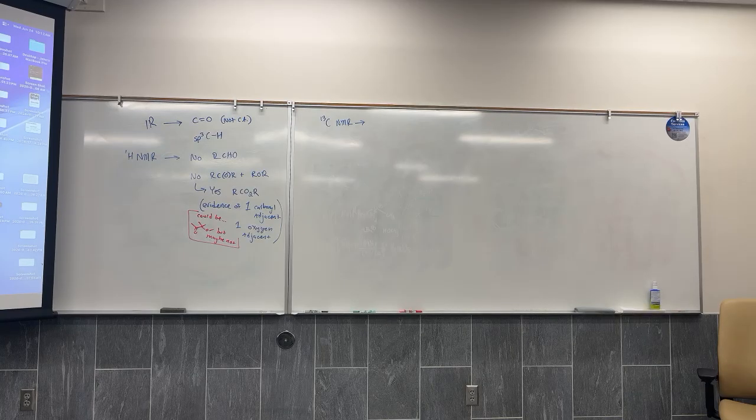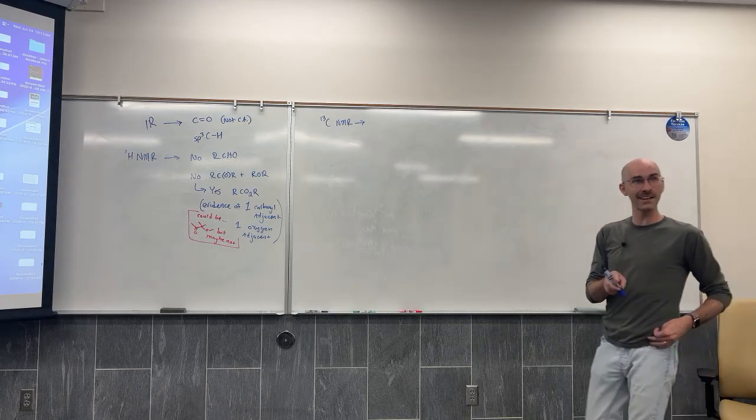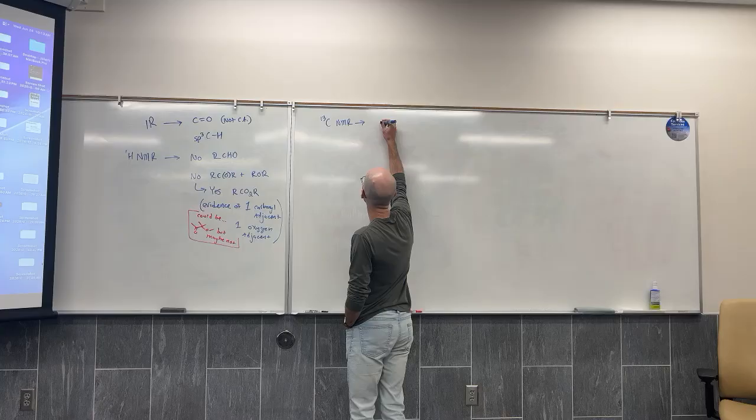An interesting feature that we can see, aldehyde and ketone carbons show up further left than ester carbons, which show up further left than amide carbons. So the fact that the ester carbon sits right here in the middle of this range, around 180, actually does something to confirm the carbon NMR, which has a signal around 180, probably being an ester and not a ketone.